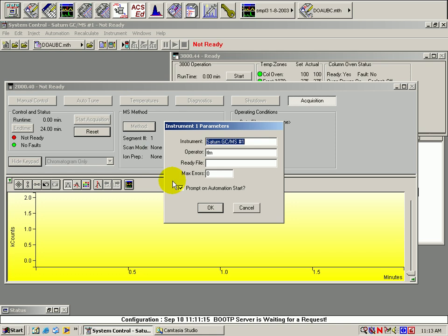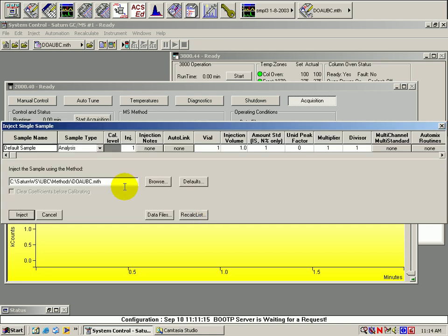Fill in the appropriate information, as well as the additional information regarding the actual sample that you will be injecting.